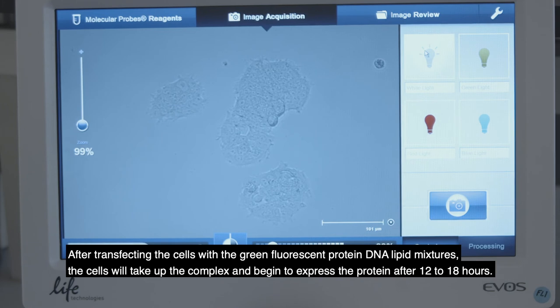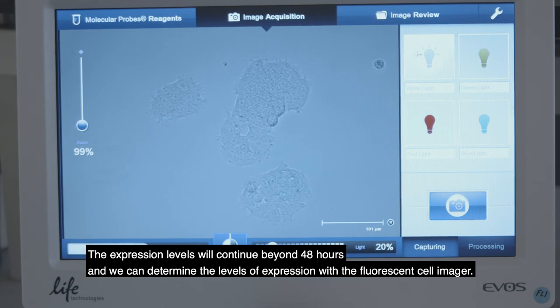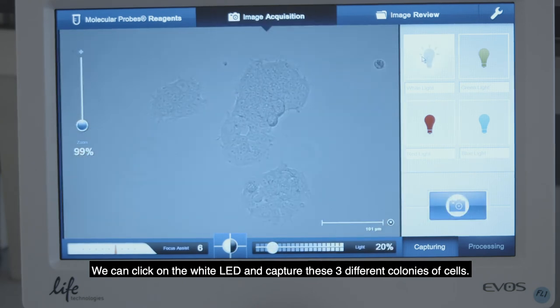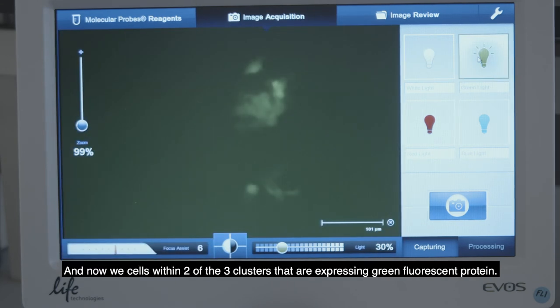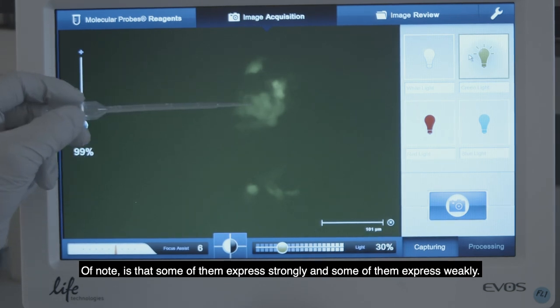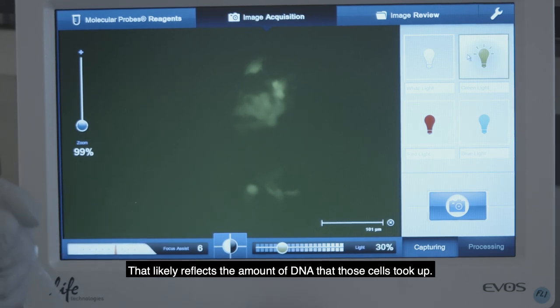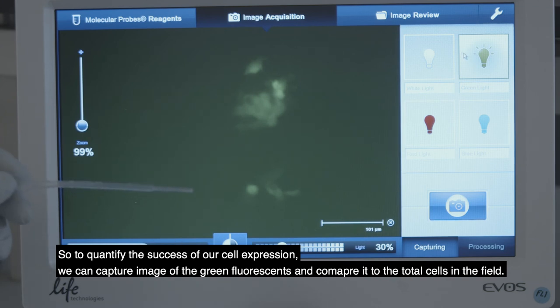After transfecting the cells with the green fluorescent protein DNA-lipid mixtures, the cells will take up the complex and begin to express the protein after 12 to 18 hours. Expression levels will continue beyond 48 hours. We can determine the levels of expression with the fluorescent cell imager — clicking on the white LED to capture three different colonies of cells to determine which ones have taken up our plasmid and are expressing green fluorescence. Clicking on the green LED, we can now see cells within two of the three cell clusters that are expressing green fluorescent protein. We can capture an image of the green fluorescence and compare it to the total cells in the field.